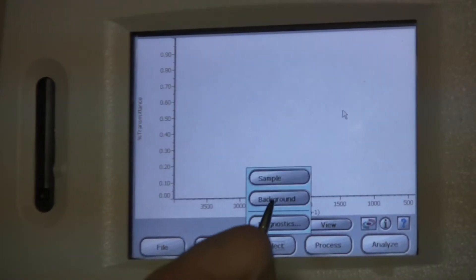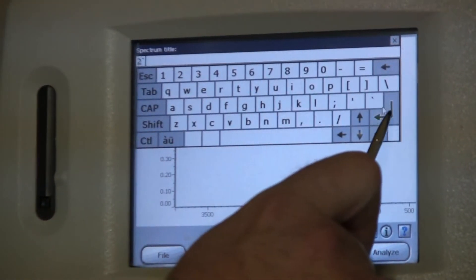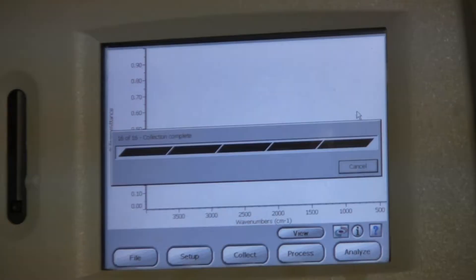Start off by going to Collect, and then Sample, and then type in any name, and hit OK. Wait for the sample to finish collecting.